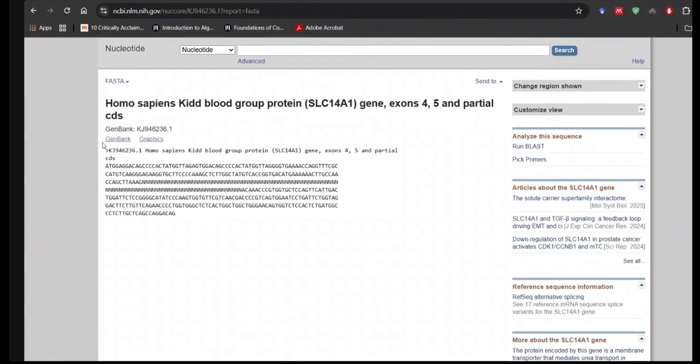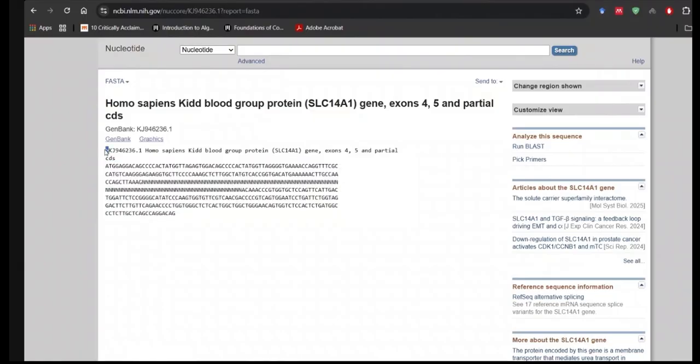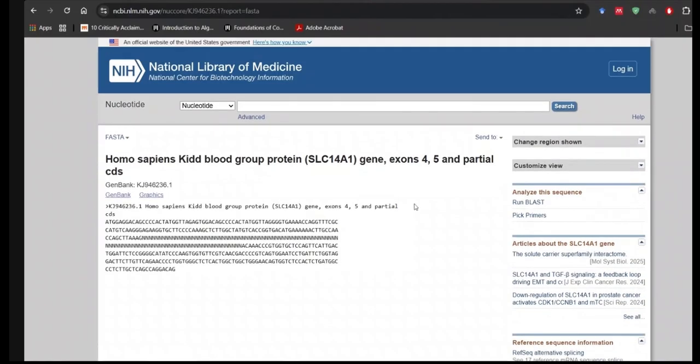And the first line of a FASTA is called a FASTA identifier or a FASTA header, which tells us about the sequence, what this sequence is, right? This is the locus, this is the species and stuff like that. You can put anything over there. This won't be directly considered in your analysis in BLAST or something. It will be kept as an identifier, and the remaining part of your sequence will be taken for the analysis. A FASTA header is marked by this sign over here, a greater than symbol. And yeah, that's how it works.